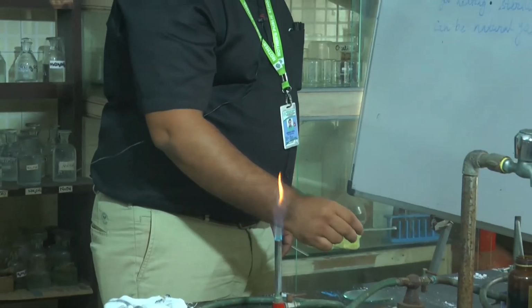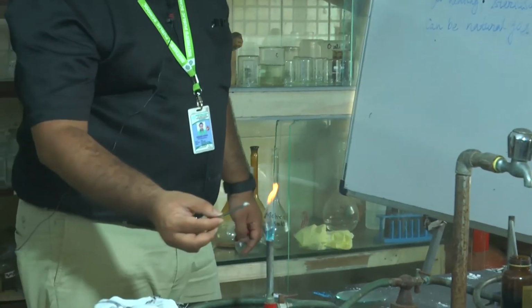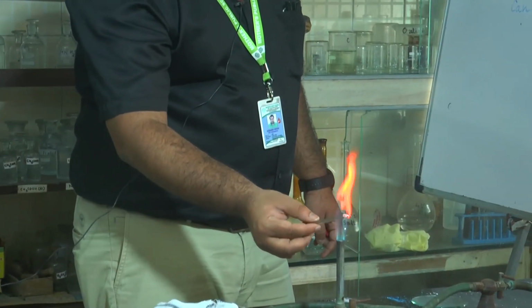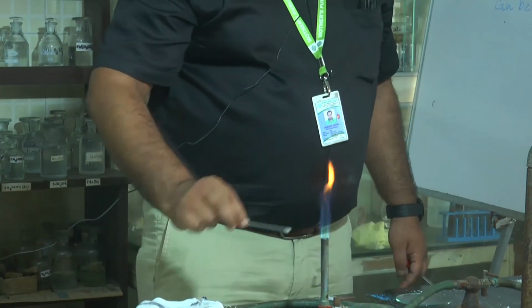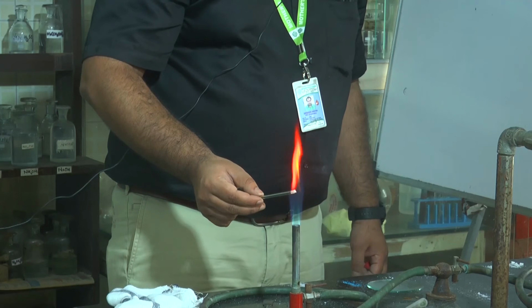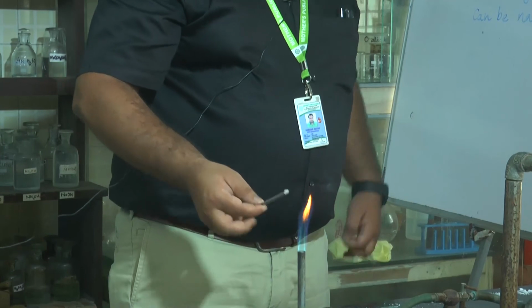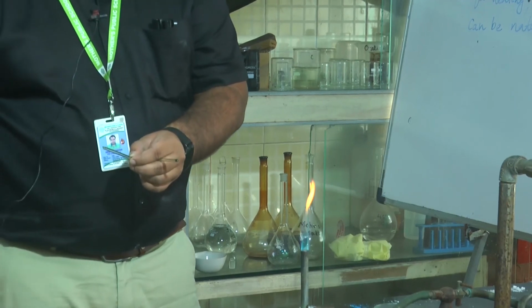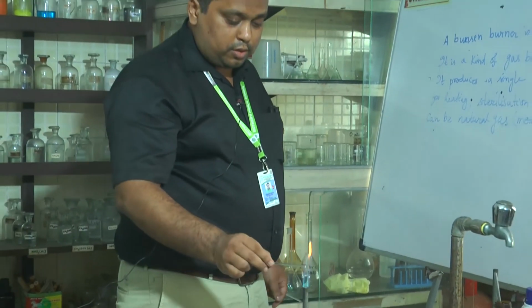Okay, first I am taking a pinch of salt like this and see which color it is showing. So this is the color you are observing, and this color is crimson red. If you get a crimson red color, that means strontium may be present. Got it? Crimson red, persistent, meaning it is continuously visible. Strontium may be present. Understood clearly, all of you?